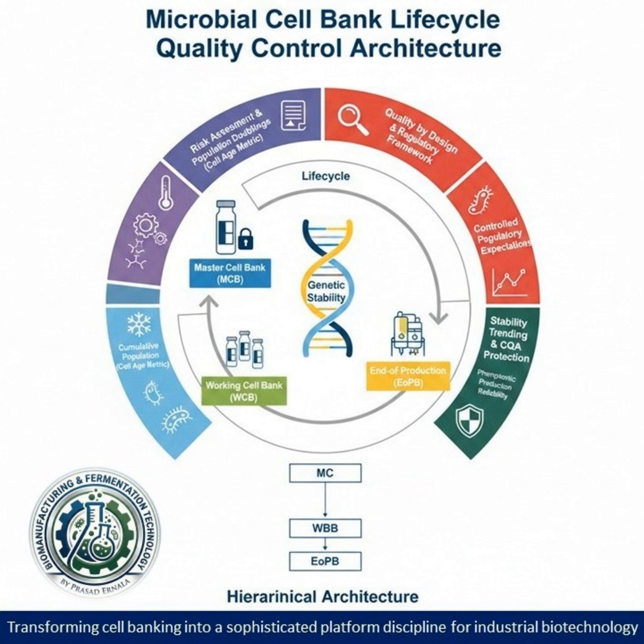Precisely. Your spec limits on the bank have to be justified by showing that the resulting culture won't cause a deviation in the final product. The strict limits on lag time, for example, are there to prevent problems in the multi-thousand-liter reactor. Problems such as? Well, if the lag time is too long, the cells won't consume oxygen fast enough at the start. You risk off-spec dissolved oxygen excursions, which kills your yield. Or if the growth rate is too slow, you might not even reach the required cell density.